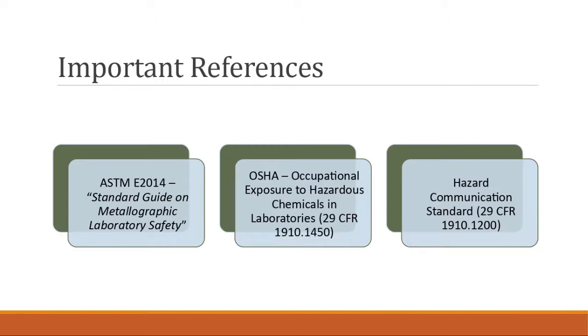You can if you want, but the only ones you'll be responsible for are the two listed here, which are 29 CFR 1910.1450 and 29 CFR 1910.1200.